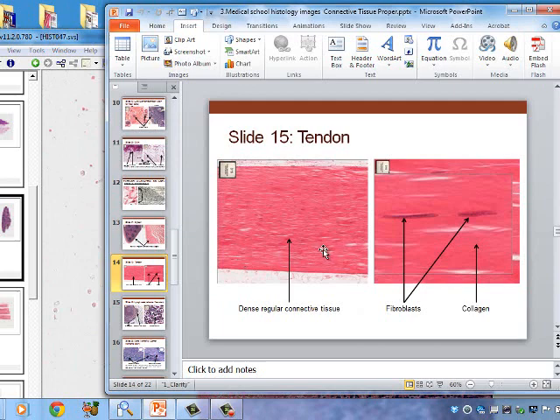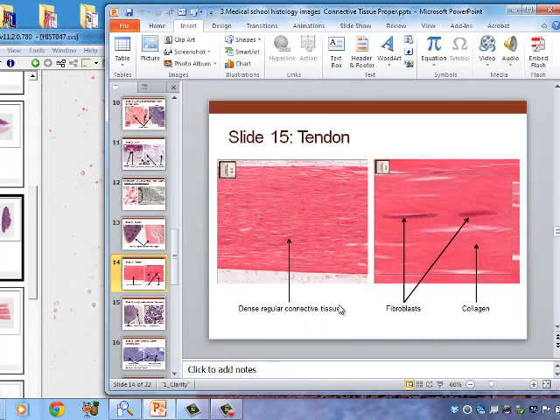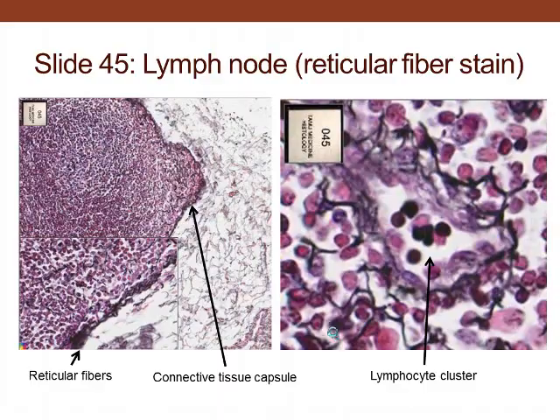The next image is of a tendon, which is dense regular connective tissue. The collagen tissue runs in one direction — this regularity distinguishes it from the irregular arrangement in the dermis. Here we see fibroblasts and collagen bundles all aligned in one direction. The dark marks visible are the nuclei of the fibroblasts.